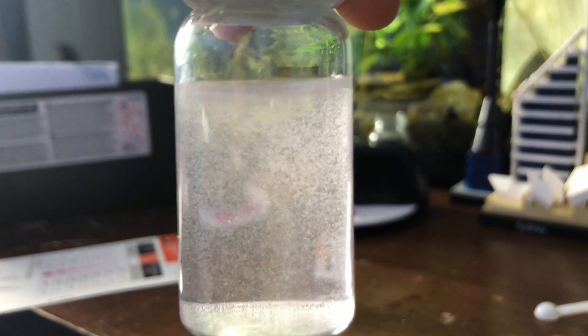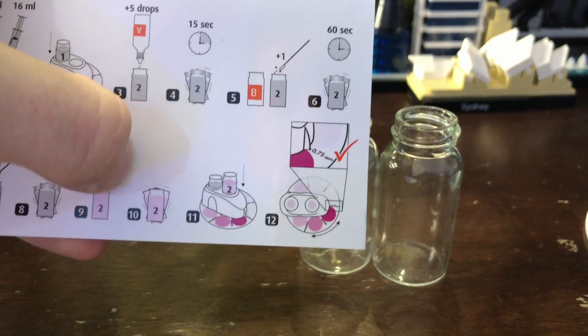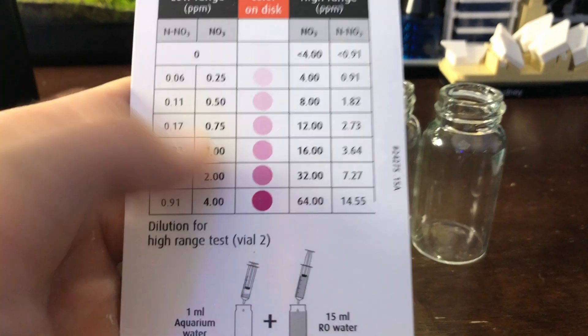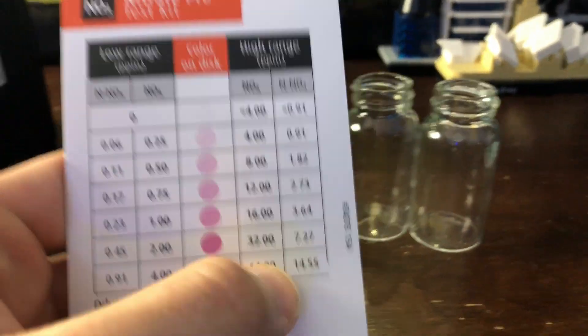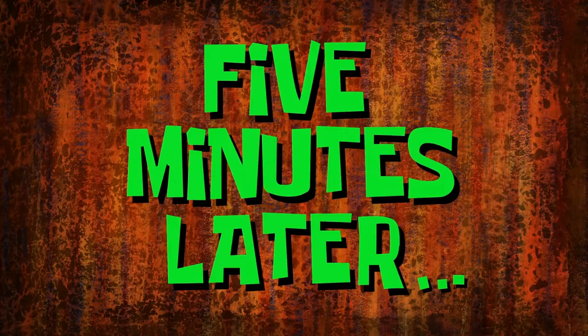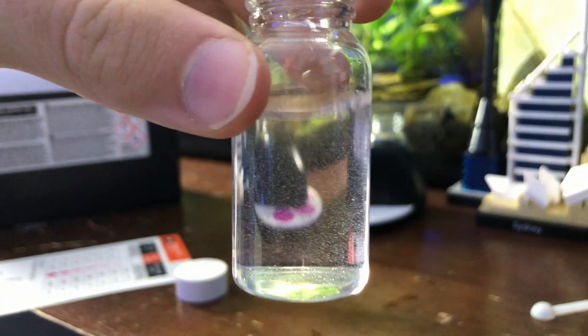Once you wait those nine minutes, you just shake it up a little bit to get the air bubbles out and throw it into the reading device. Now once I read it, it's going to show me on the reading device the low range number, and I'm just going to take that number and correspond it to the number on the high range side. Hopefully that will be almost clear or just a little bit of pink. Five minutes later — alright, we're looking good. At this point I would normally not even put it in the comparison table, but just for the purpose of the video, I will.